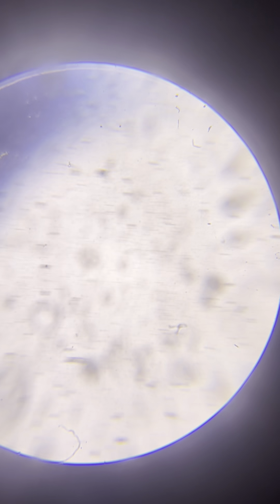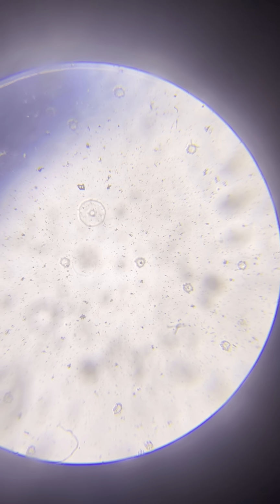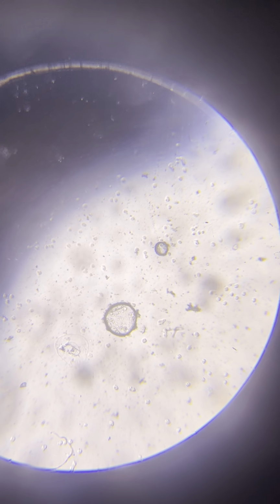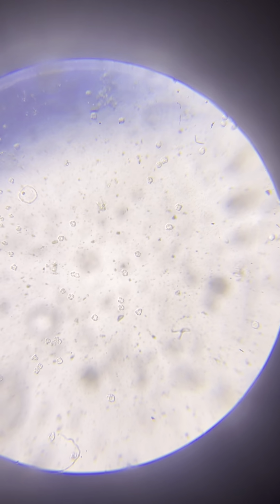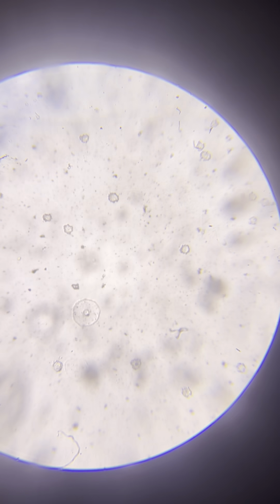I've also added algae to the mixture, from old sushi algae that I had. So I would assume the problem is most certainly oxygen and not material, solid food sources. And again, the most successful way to overcome it is just to use the non-sealed aquarium. But it's kind of a health hazard and certainly a smell hazard. So I refrain from doing it right now, but I've done it during April and May and June.